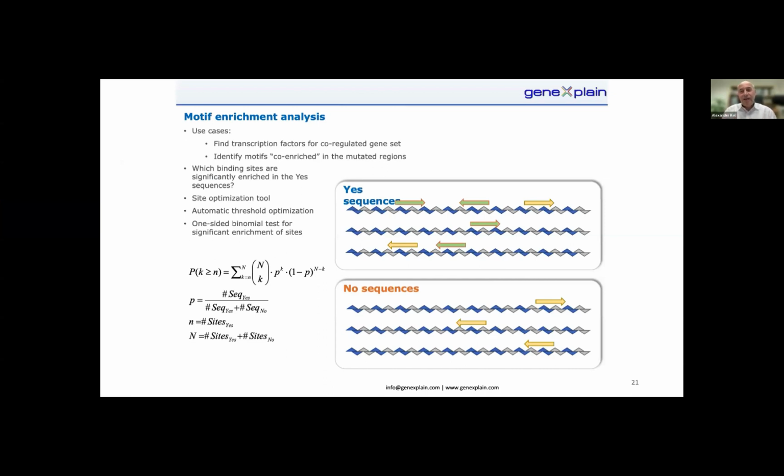That's fundamental. Often what you are faced with is that you have your set of 100 genes, your genes which are upregulated, and you want to analyze these genes, and you forget in which condition this happens. But you always need a control. So you always need something to compare with.